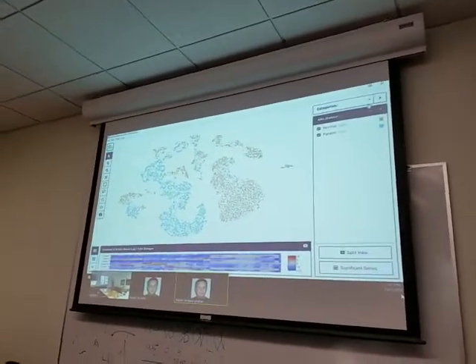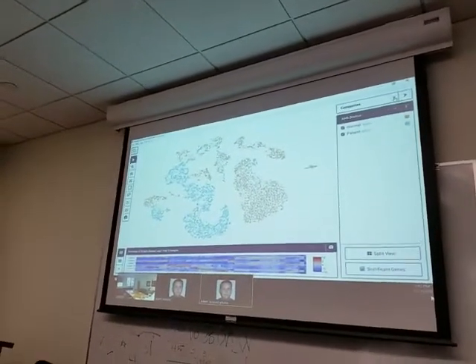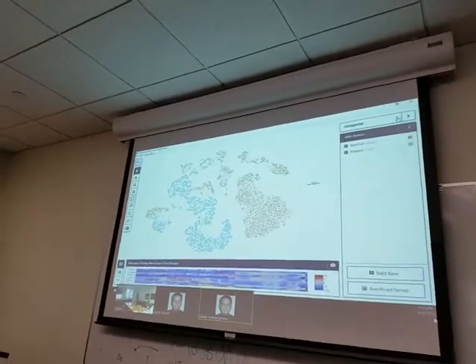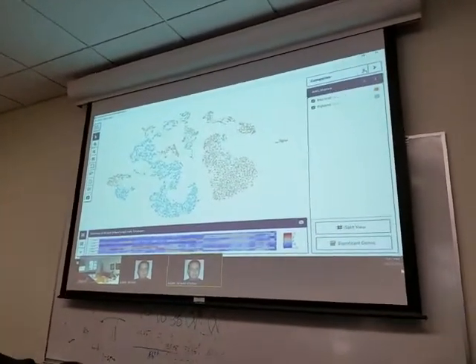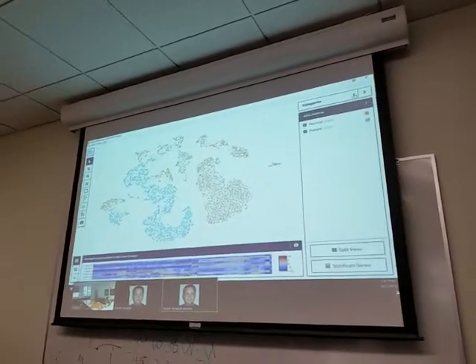Wei Chen's here. Wei Chen, can you ask a question? I just want to know more on the VDJ, how we can do the circle plot, or look at Circos plots in a more big data way to look at a certain population where there is a specific mutation.